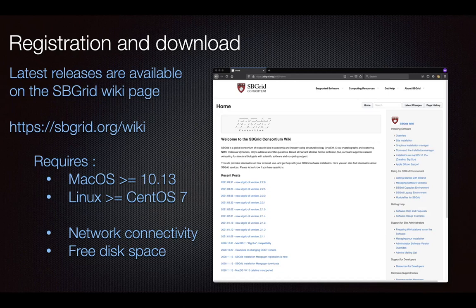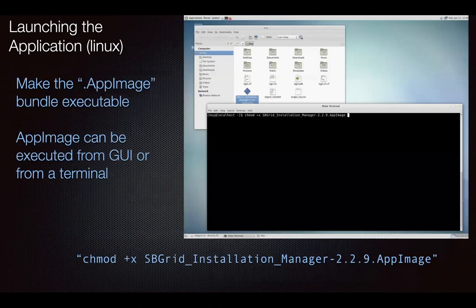A month later, if you need it back, you just install it again. So it allows you to keep a rotating set of software, even if your disk is only, say, 512 gigs, or maybe you've got a 1 terabyte. But if yours is like mine, it's full of lots of other stuff, so you don't have a lot of space around for software.